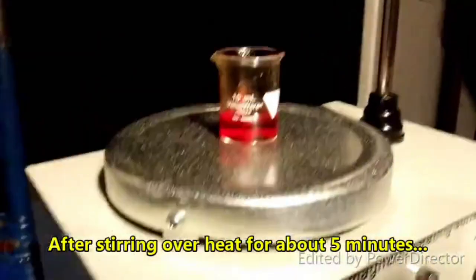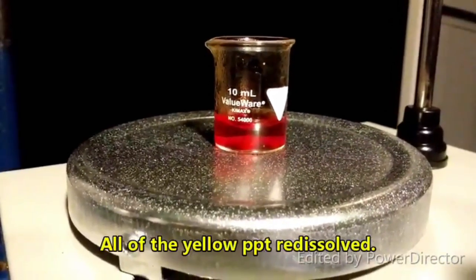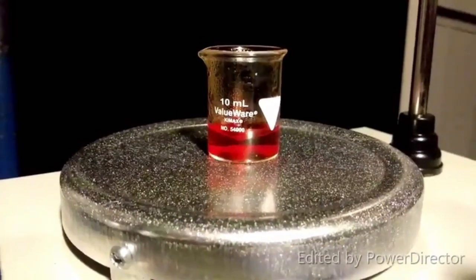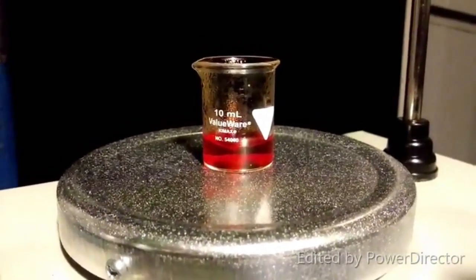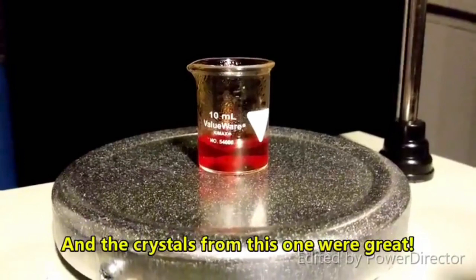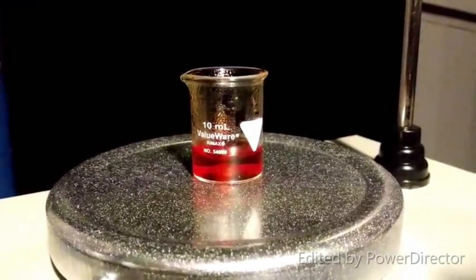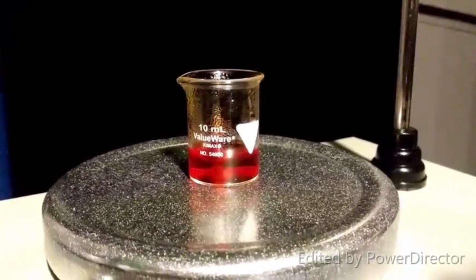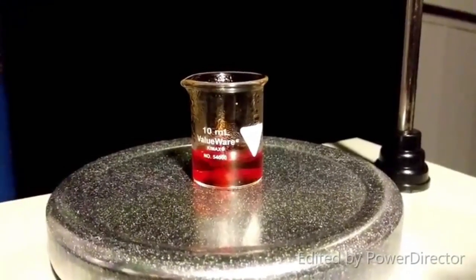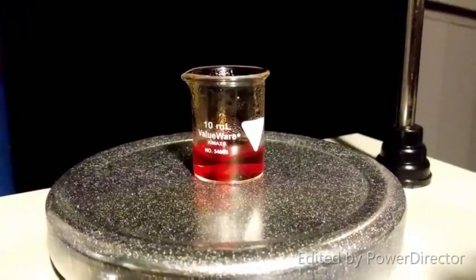Okay, it looks like that reaction just took a little bit longer. So this should be dipotassium thiocyanatoplatinate. Cool. Yeah. Can't give up too quick. That is so neat. I think what we may have gotten at first was dipotassium hexachloroplatinate, which then reacted when I started heating this up and letting it stir for a little while to form the red dipotassium thiocyanatoplatinate.